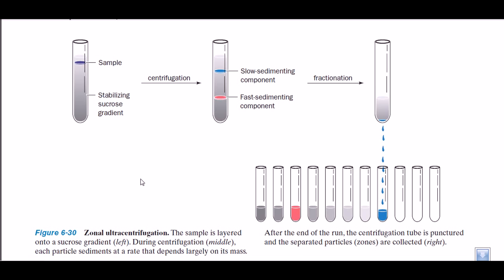In this case, we'll talk about a centrifugation procedure with a gradient. So we have sucrose as that medium. We need a very fine medium which provides the matrix, the platform for centrifugation of different macromolecules. So in this case, we take sucrose. And why do we take sucrose? Because sucrose can lead to the formation or fractionation of different densities.